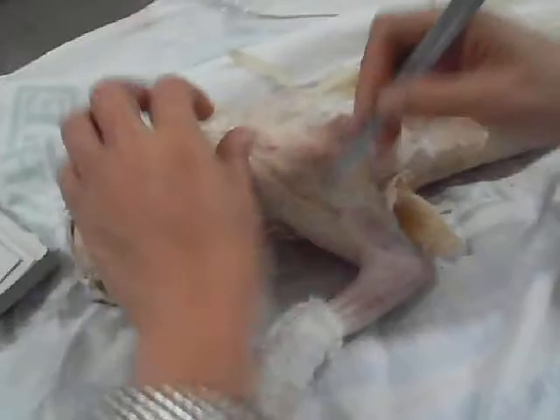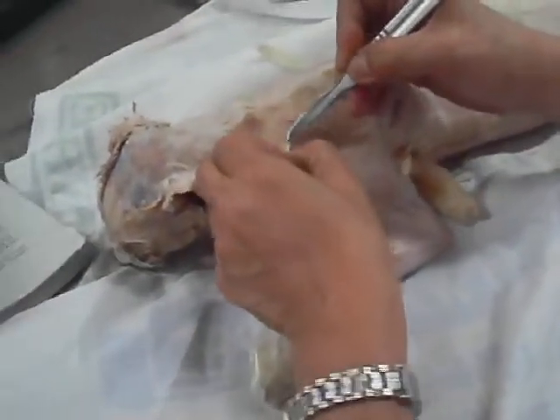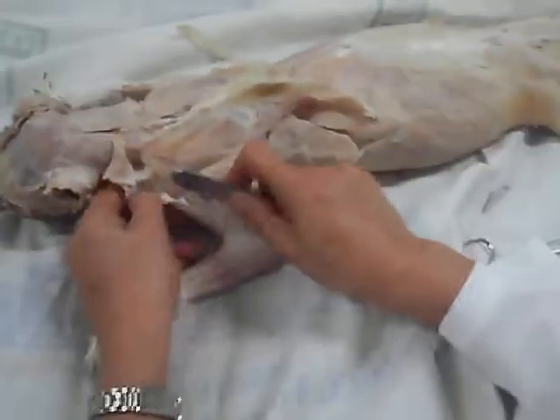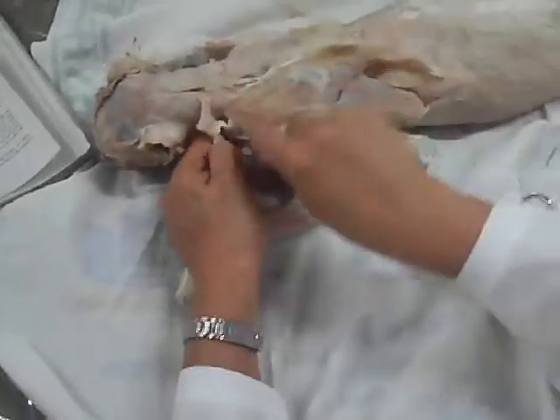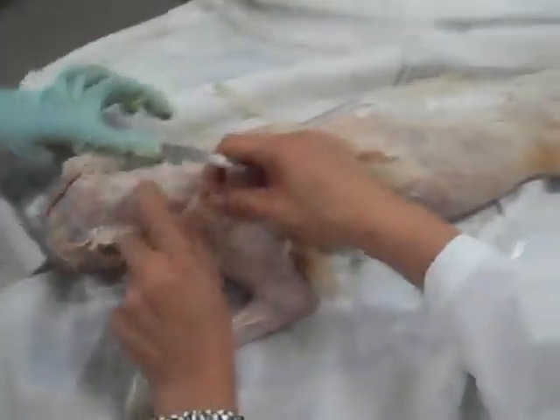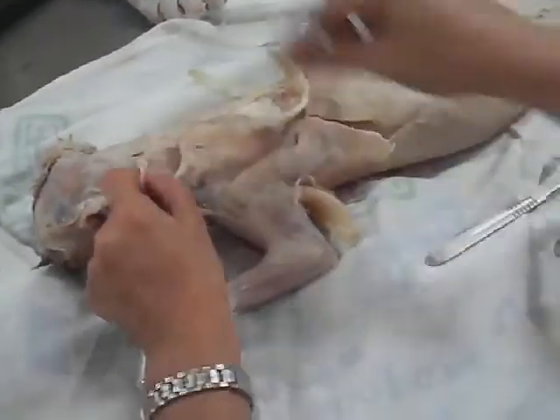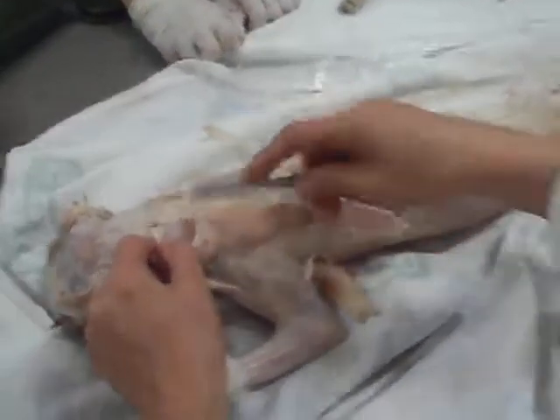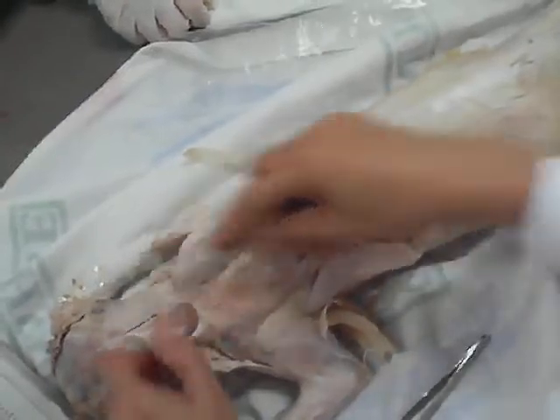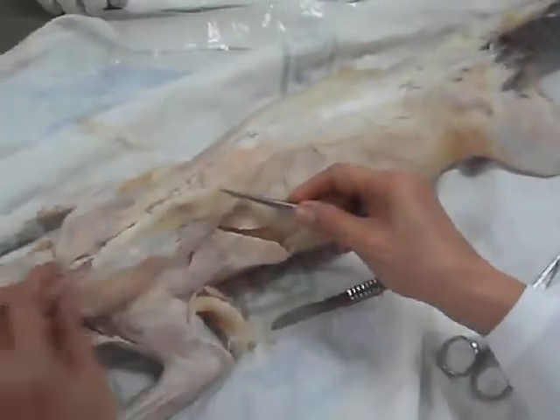You have to clean first. In my case I can cut, because I know the origin and the insertion, without destroying any muscle. So this is now the clavo trapecio — the one that you have studied last meeting. For today: clavo trapecio, acromio trapecio, spino trapecio.